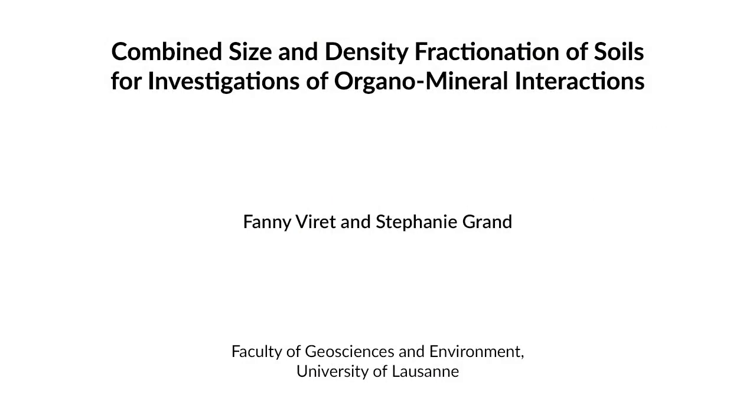This method is an interesting approach to study organo-mineral interactions because it fractionates soil organic matter according to its association with different minerals. It is a physical fractionation process, which means it doesn't alter the chemistry of the fractions. As a result, analysis of the fraction tells us something about the natural composition of organo-mineral complexes. This method is really useful as we try to learn more about the ability of different soils to sequester carbon away from the atmosphere.